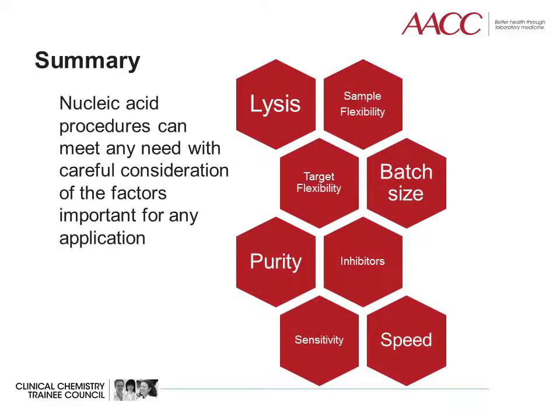So many procedures are available today to prepare DNA and RNA from a wide variety of sample types. The procedures can be done fast or in large batches. The resulting nucleic acid can be very pure or just pure enough. With so many molecular methods out there today, nucleic acids can be easily isolated from a variety of sources for downstream detection.